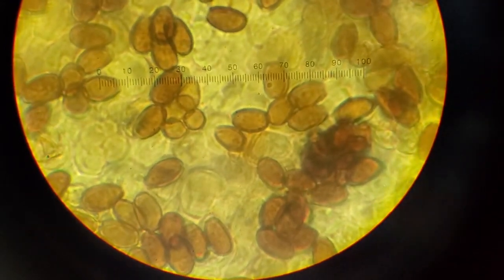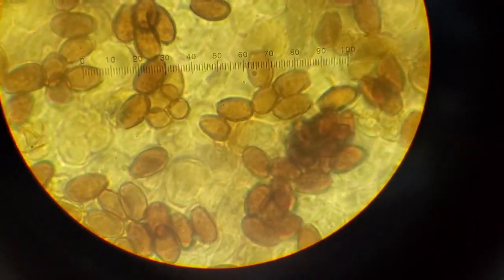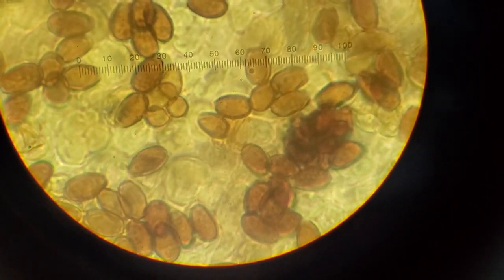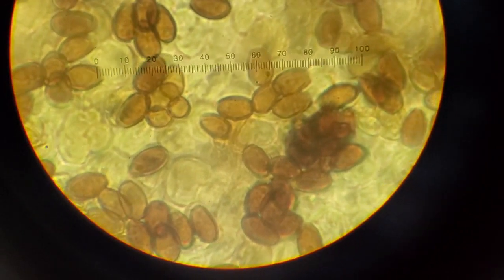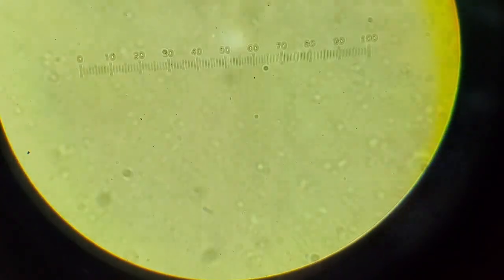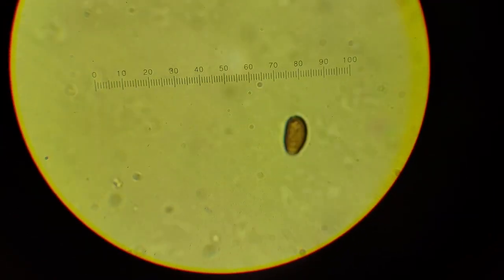And this is nice to just get an idea of pigmentation. This is a dark spored, brown spored specimen, so this makes perfect sense. And this is just water, but you can see the colors en masse. But for measuring spores, the best thing to do is to find them free floating, even if that means that they might be moving around, and you have to chase them down. But ideally, they'll be like this.